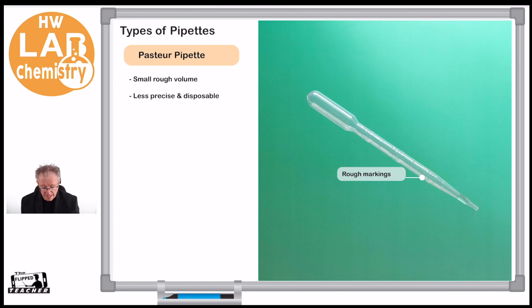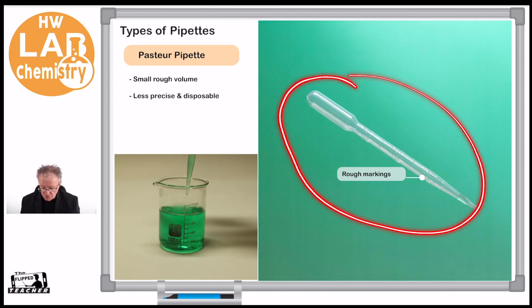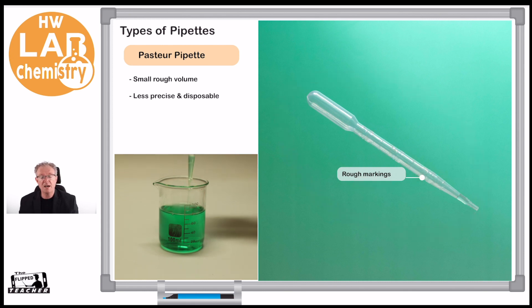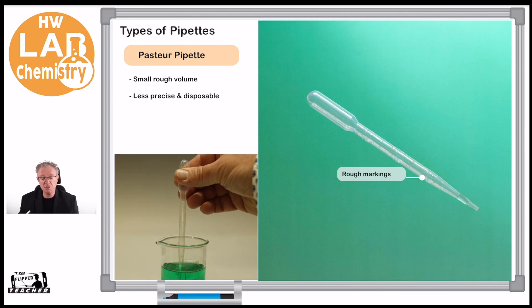And then we have the last type of pipette, which is called a Pasteur pipette. This is for rough measurements—we've got rough markings along here. As you can see in the video, we can just squeeze it, put it into our liquid, let go, and it just sucks up. It's for moving small amounts of liquid from one place to another and adding things dropwise to experiments, for example.